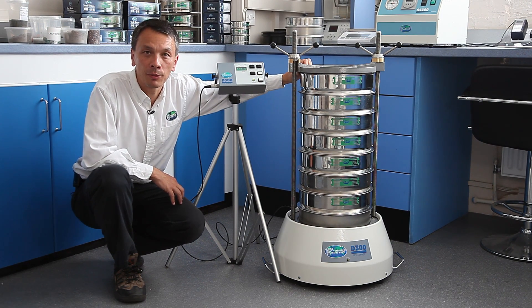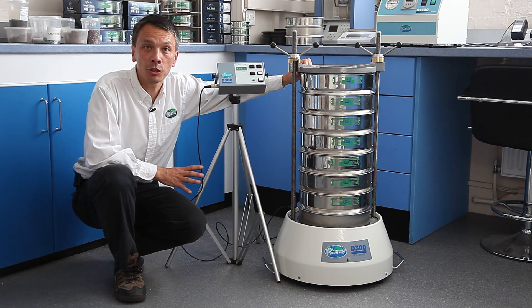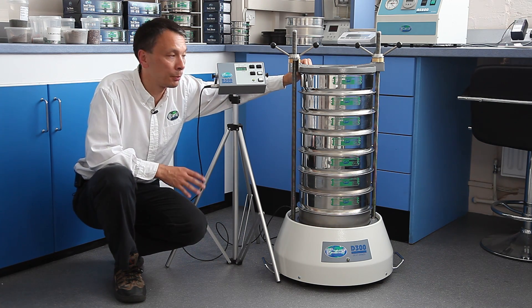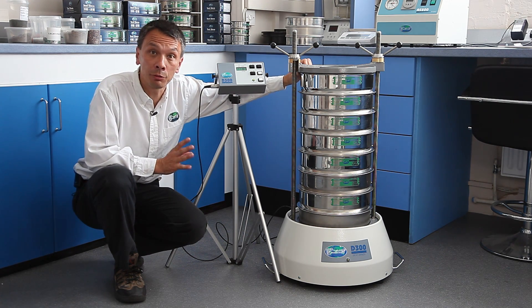The Octagon D300 — this is the newest shaker in our range. It is electromagnetic and designed to fill the gap between the D200 and the D450.